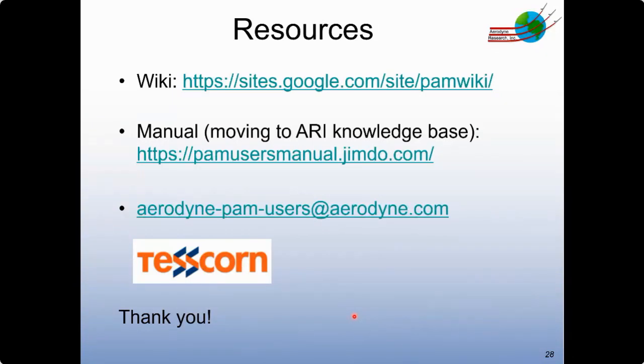The most well-known system for that I'm aware of is isoprene SOA, which forms species that are taken up into the aerosol from reactive uptake and whose uptake is enhanced by acidic conditions like sulfuric acid. But there are likely other systems out there that I'm just not aware of where sulfuric acid can play a role.